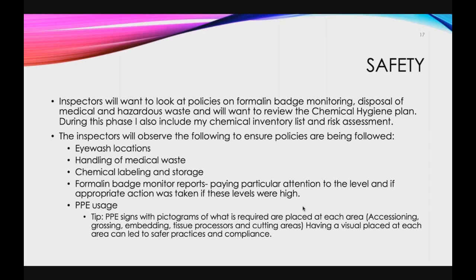PPE usage. They will look to make sure during the initial tour that proper PPE is being followed. If they come to an area where they may question why somebody isn't wearing gloves or a face mask, what we did was put up PPE signs and pictograms of what is required in each of the areas. So for accessioning, we put what was required and what was optional. For cutting and hazardous waste, we have different pictograms for each of them and what PPE should be worn.